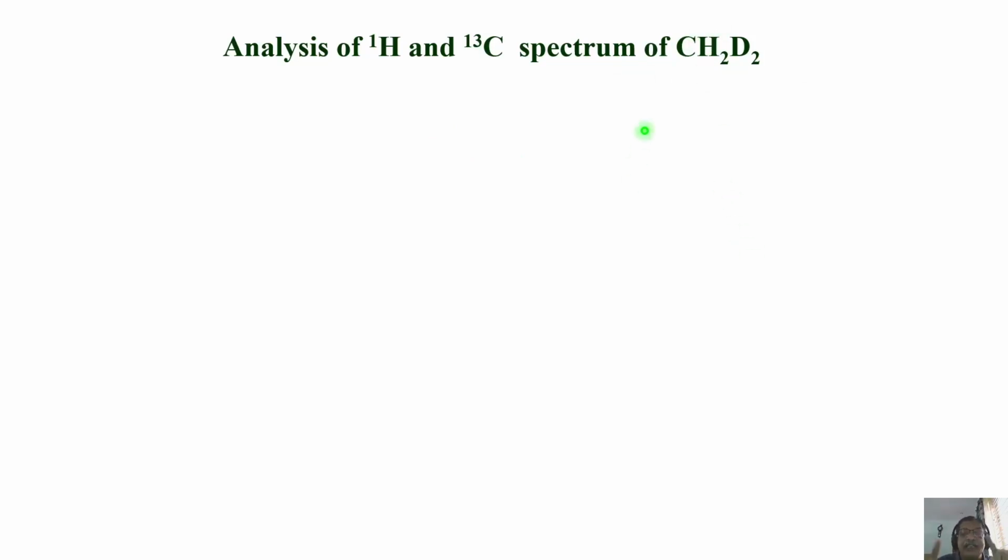We are studying this molecule with carbon 13 in natural abundance. Remember, it is not a labeled system. Let us get the proton spectrum.